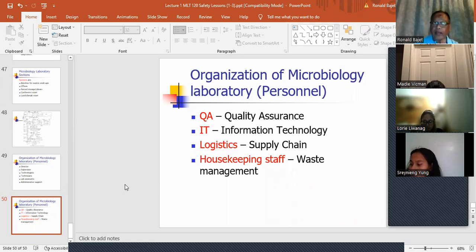What that does, it receives information from the laboratory about your results. So the LIS processes results from the instruments into the LIS. It has the patient's name, medical record number, etc. And then it sends that information from the LIS to the HIS. And the HIS is what the doctors use. It's what the administration uses. So that's the bigger picture. It's the HIS. So that's information technology.